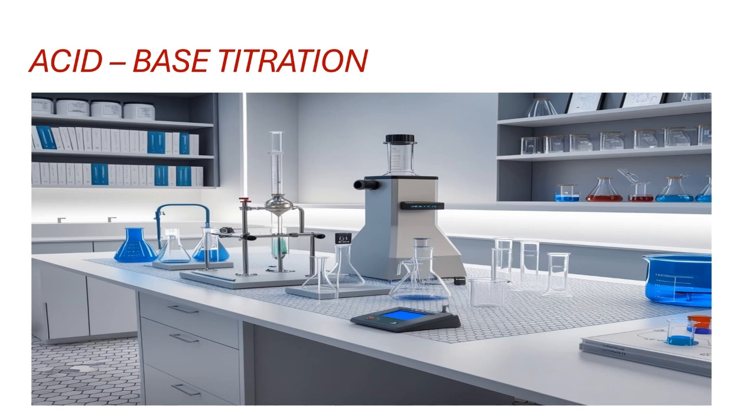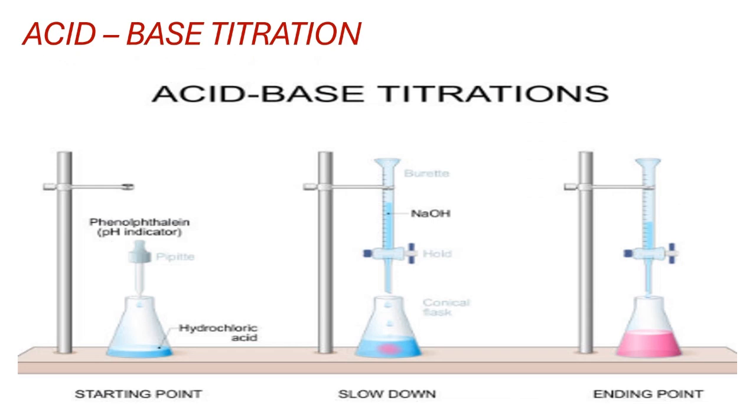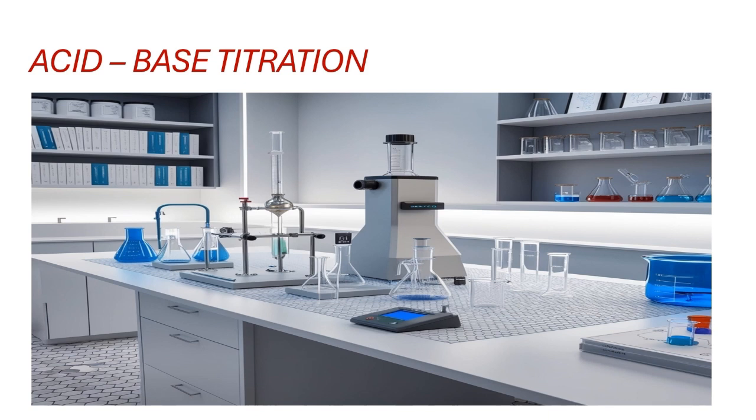Acid-base titration. An acid-base titration is a method of quantitative analysis for determining the concentration of an acid or base by exactly neutralizing it with a standard solution of base or acid having known concentration.